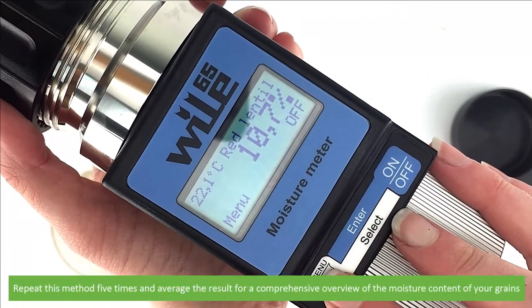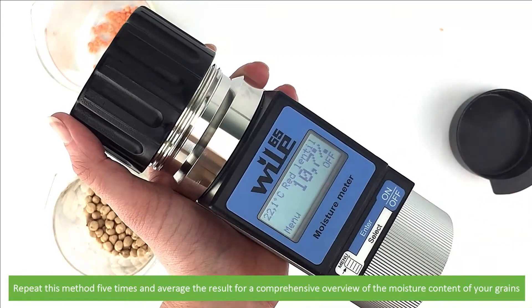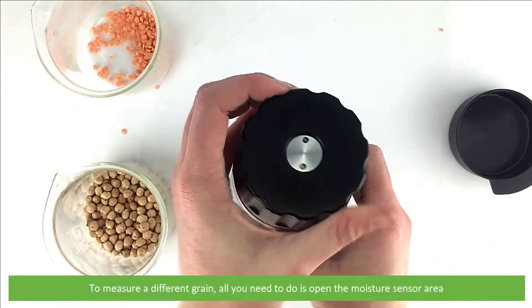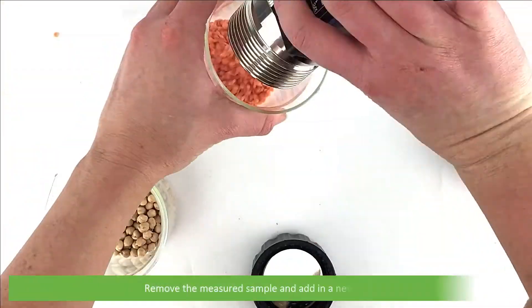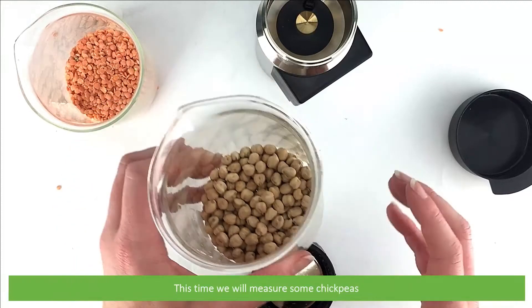Repeat this method at least five times and average the result for a comprehensive overview of the moisture content of your grains. To measure a different grain, all you need to do is open the moisture sensor area. Remove the measured sample, then add in a new sample. This time we will measure some chickpeas.